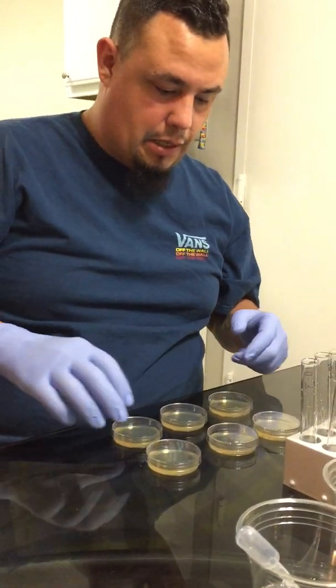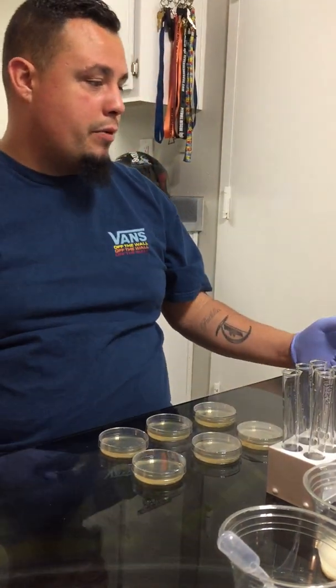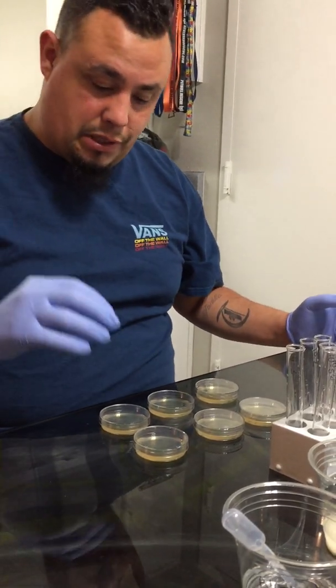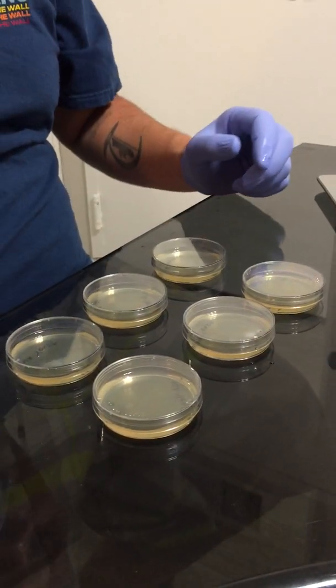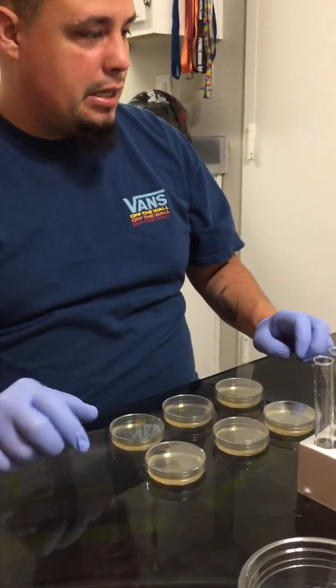Okay, so now we have our 6 plates poured and they are ready for incubation. We have all of our lids on. To store them, I'm going to flip these over, and what it does is it secures the cap and reduces any chance of contaminants or anything like that.